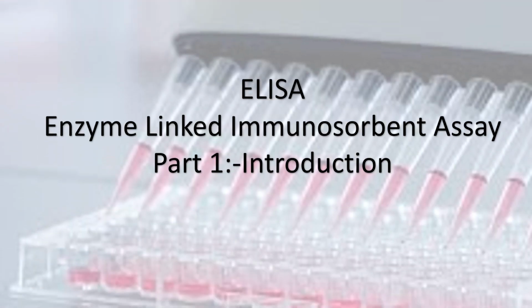Hello learners, today we are breaking down the ELISA topic in the simplest way possible. As we know, ELISA is a widely used laboratory technique for detecting and quantifying biological substances such as proteins, peptides, hormones, and antibodies. It is based on antigen-antibody interaction and uses an enzyme-linked detection system to produce a measurable signal, usually a color change. So let's get started.